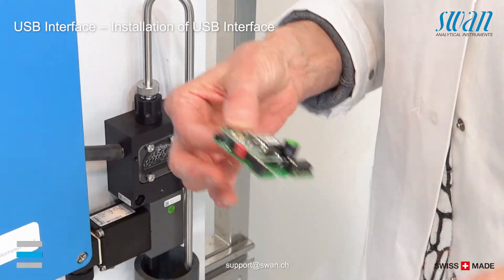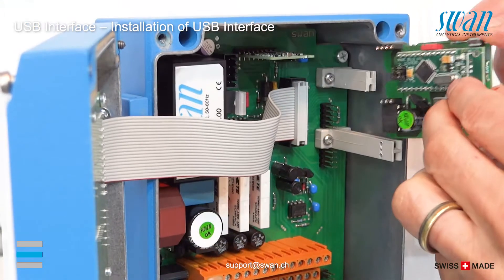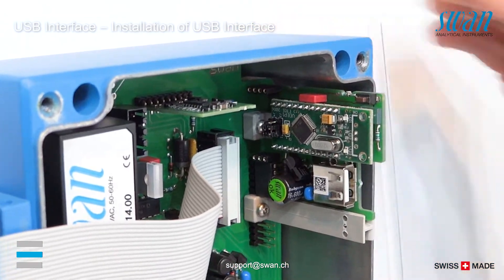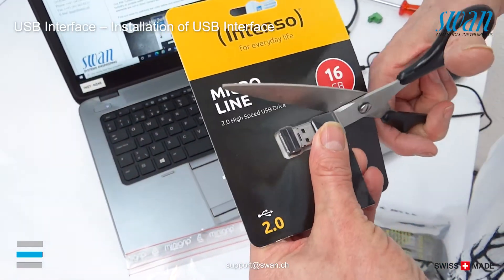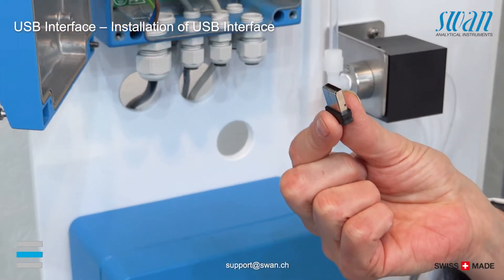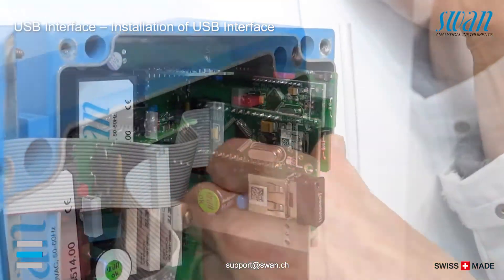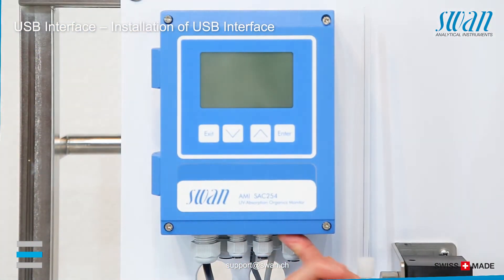Insert the USB interface into the slot with the plug facing towards the mainboard. Insert the USB stick into the USB socket. Close the transmitter housing and switch on the power.